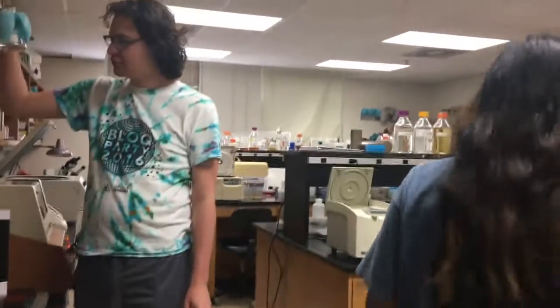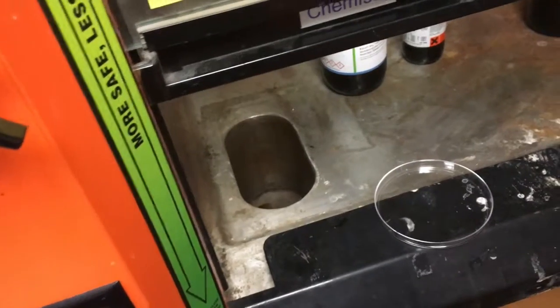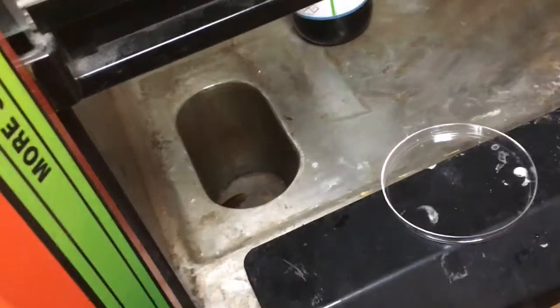That's what we found, guys — in the fume hood. We should name it. Do you think it's still alive though? I don't know. Touch it.